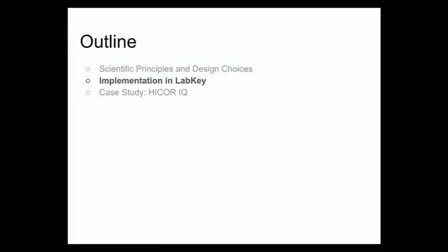I don't know if anyone has a question or two or a comment or anything before we go on to thinking about these general things and how we go about implementing them in LabKey.